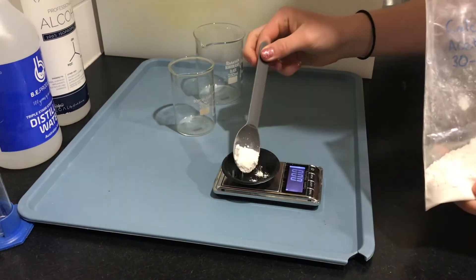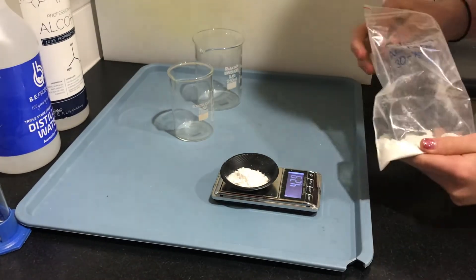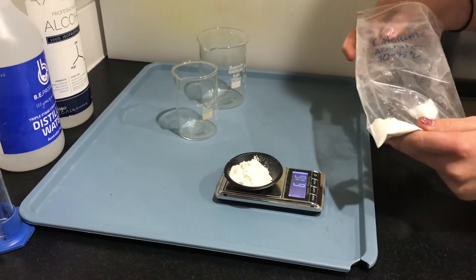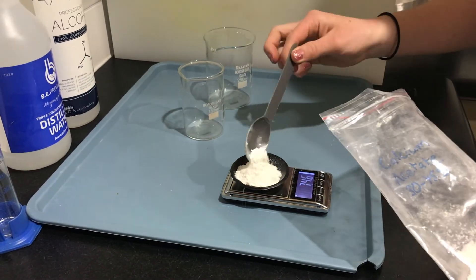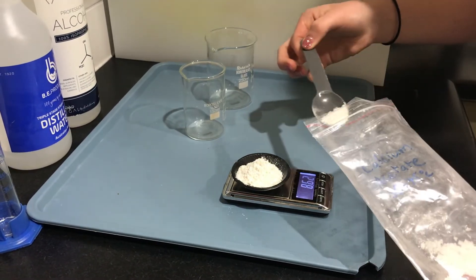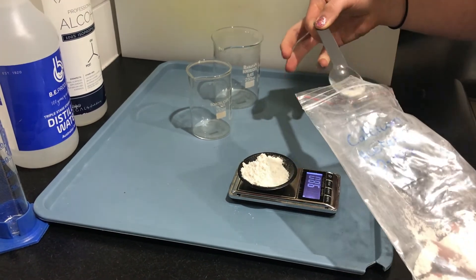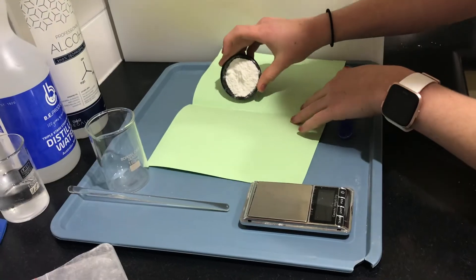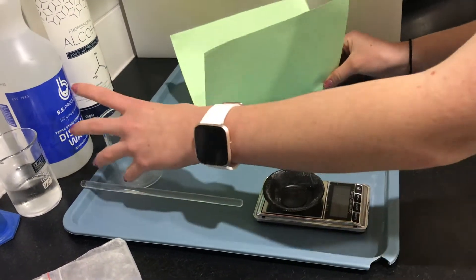Using the calcium acetate I made in my first video, I weigh out 10 grams. I then pour the 10 grams of calcium acetate into a beaker and add 30 millilitres of distilled water.